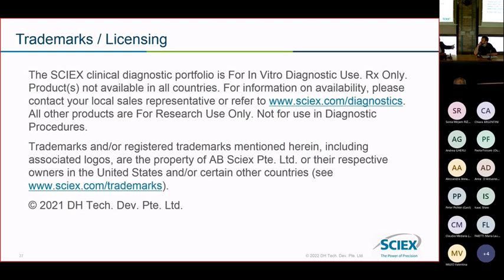He published as well in the UK first with the 5600, always focusing on high throughput, starting with the micro approach for that characteristic and ending up with analytical columns at 800 microliters per minute, right? With scanning SWATH. But I think the community is missing scanning SWATH. They would like to work with it. No, scanning SWATH is an R&D product, not a commercially available product.